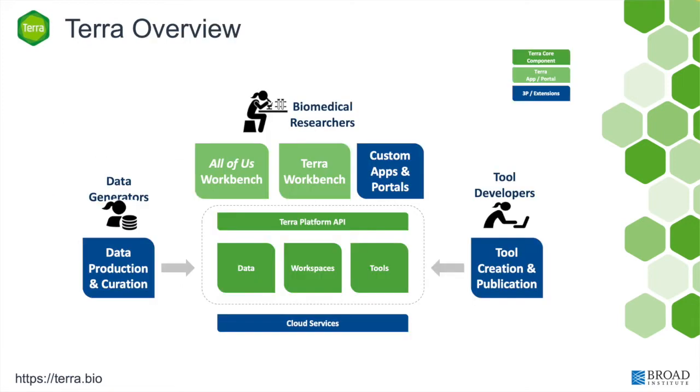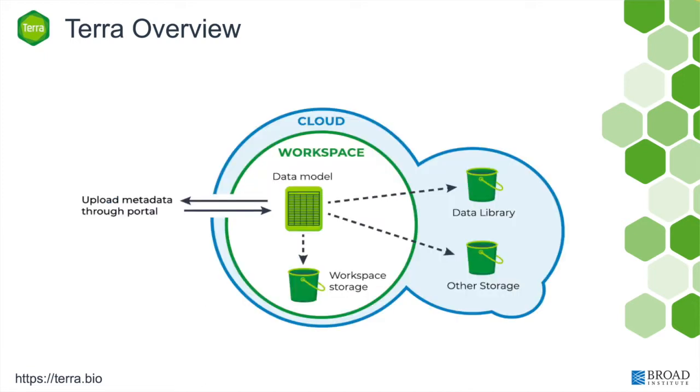Terra is built to streamline the interaction of three types of scientists: data generators, such as clinical scientists; tool developers, such as the computer scientists here at Broad; and researchers, laboratory scientists who want to turn data into actionable observations. A Terra workspace is a computational sandbox that lives in the cloud and can access local and cloud-based resources outside of itself, as well as store data in its own dedicated Google bucket.